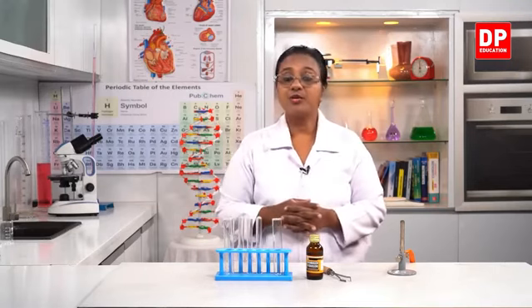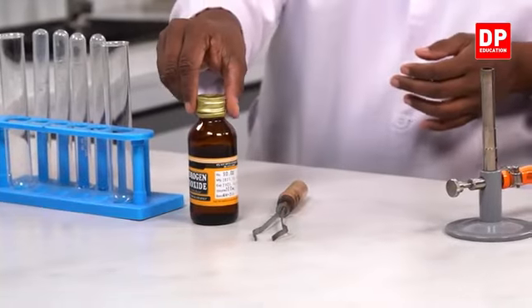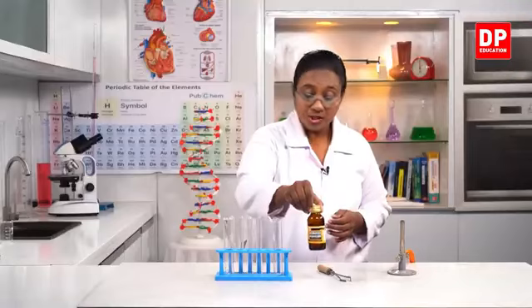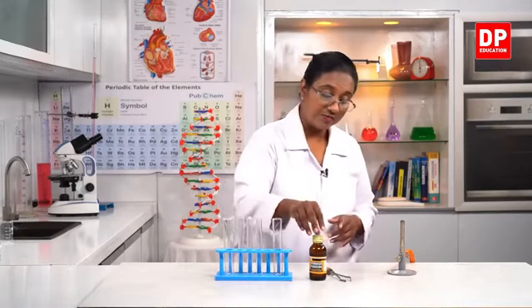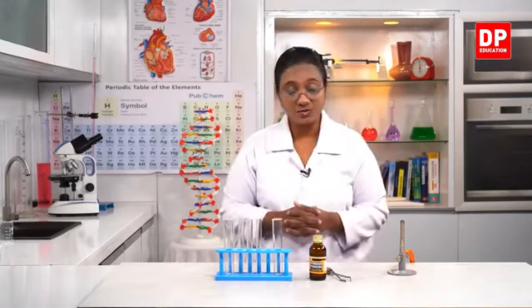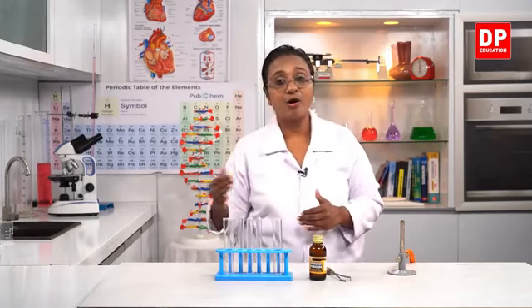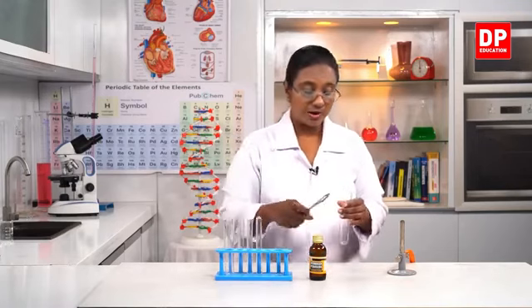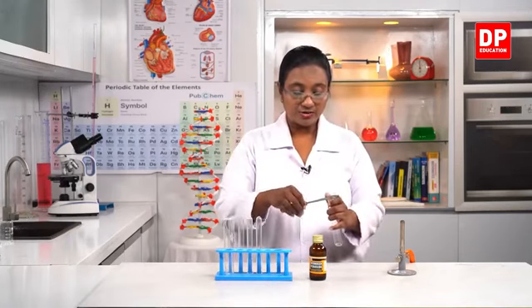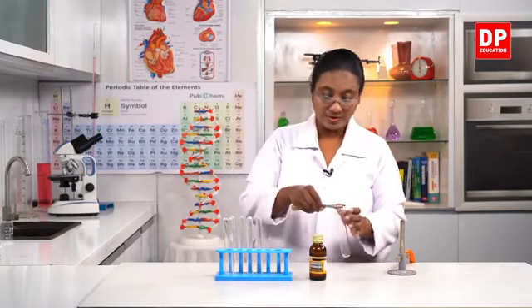So here I am going to do another reaction, that is with hydrogen peroxide. Here you can see students, it is hydrogen peroxide. Usually at room temperature also hydrogen peroxide can decompose slowly. To prevent that, we store it in brown colored glass bottles so that the sunlight does not penetrate in and the reaction can be prolonged or prevented. Now I am going to take a small amount of hydrogen peroxide into the boiling tube. We will need to heat hydrogen peroxide.